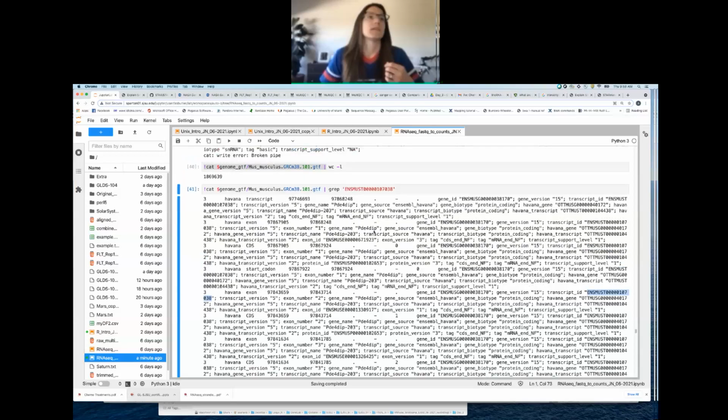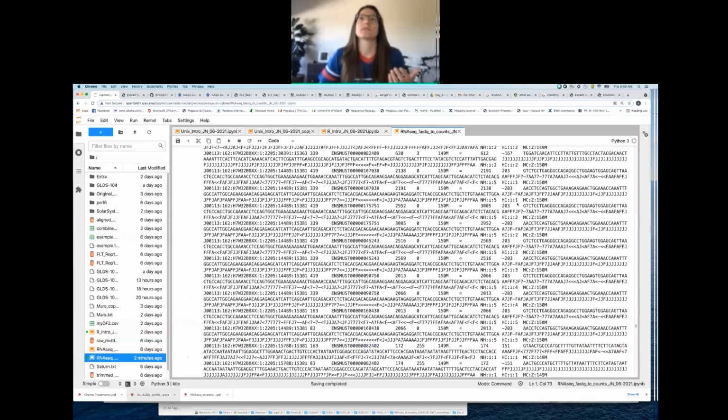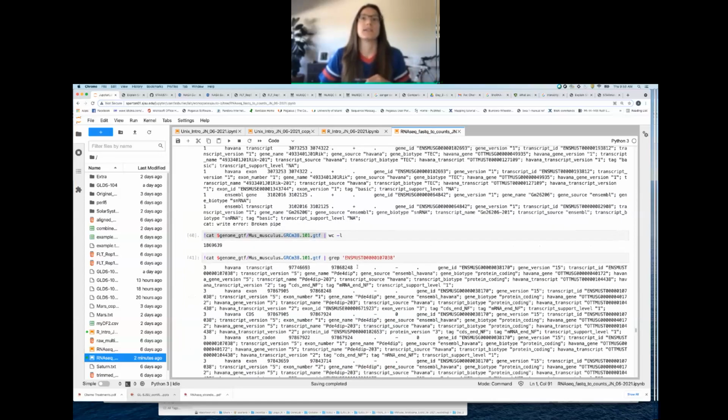One thing that we can do is, now we know that this transcript comes from this gene that ends in 38170. We can make a note of that. I'll write it down. 38170 is the gene this first transcript comes from. Then we could run this again for each one of those 5 transcripts that the mate pair is aligning to. So this was the first one that we looked at. Now we can grab the next one and see if it's indeed that same gene.